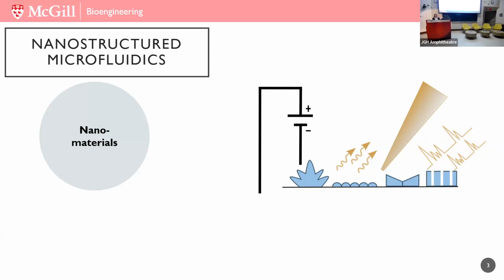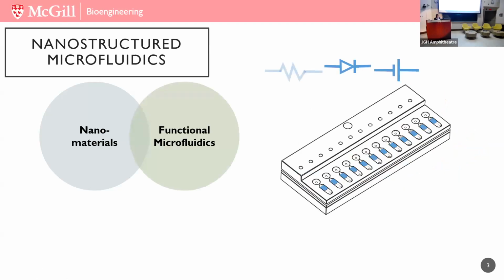But definitely you cannot just hold this material in hand and run any assay unless it is combined with a sample handling system that we call microfluidics. These microfluidics are great in terms of bringing those lengthy protocols, and a large sample volume, into a small scale.